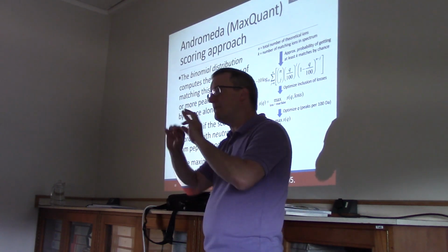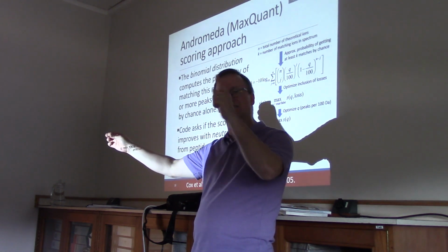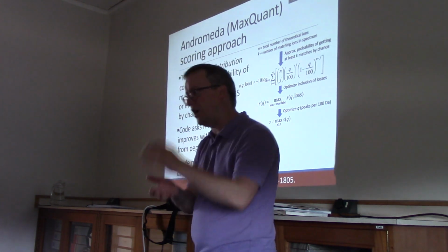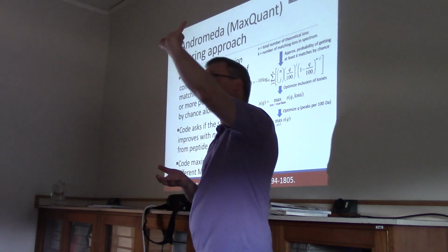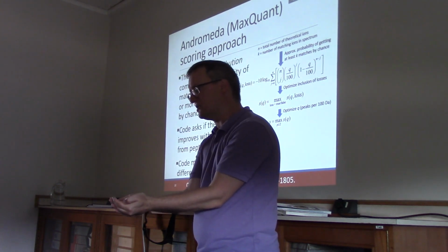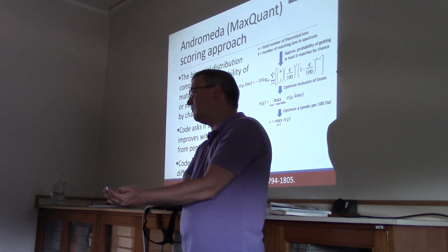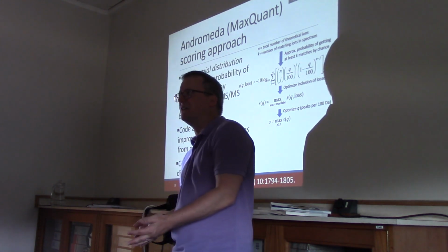So if you imagine the predicted spectrum as an m/z line that just says these locations should be occupied and these others shouldn't, you can think of that as being a draw on your jar of marbles. Everywhere you predicted there was a spectrum, you draw out the marble corresponding to that m/z location. And then you look in your hands and you say, well, I went looking at 20 locations in this spectrum for a peak, and 15 of them I observed a peak. What do you do with that? Is that a good score or is that bad?